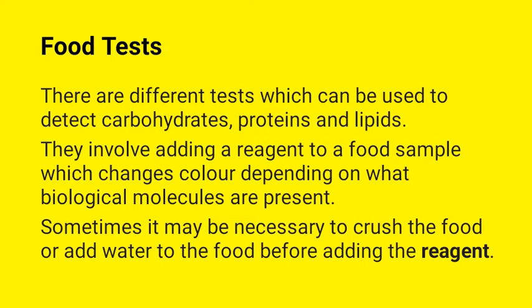Sometimes we add food in the powder form. Sometimes whole food is taken, not crushed. And sometimes we use a liquid food in order to detect the presence of different food components.